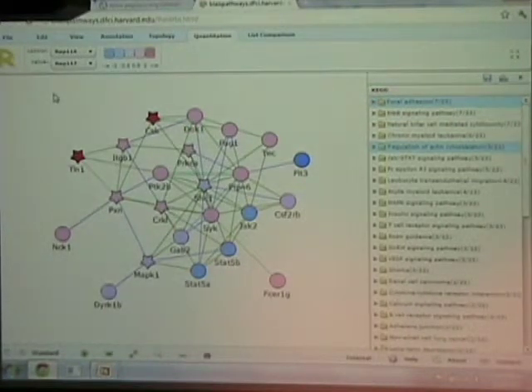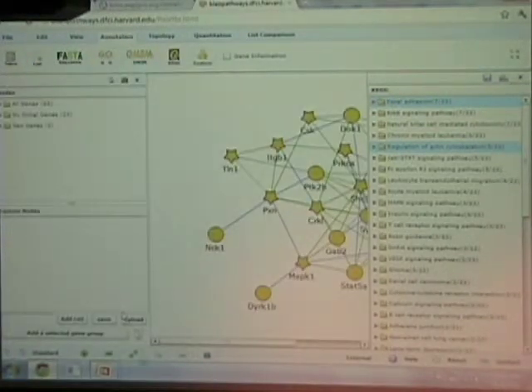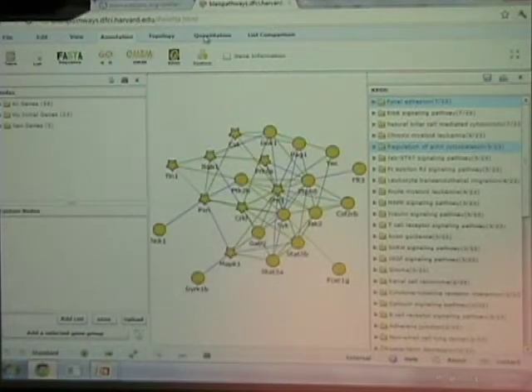At any rate, all of what I've shown you up till now has an equivalent in other genomic tools. Before I show you something proteomic specific, I just want to do one more step, because even some genomic tools don't do this particularly well. We can go back to what we were looking at, select, say, things that we see going up.